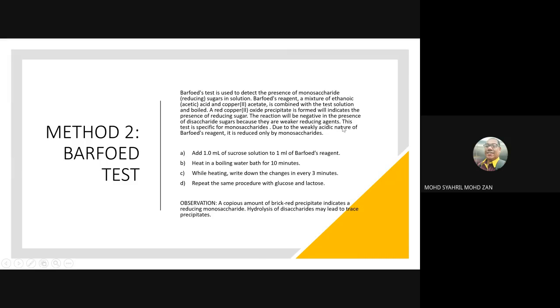Due to the weakly acidic nature of Barfoed reagent, it is reduced only by monosaccharides. Procedure: put 1 ml of sucrose solution and mix with 1 ml of Barfoed reagent; boil for 10 minutes, recording results at every 3-minute interval. Repeat with glucose and lactose. Expected result: a copious amount of brick-red precipitate indicates reducing monosaccharides. For disaccharides, hydrolysis is needed first and only a trace amount of brick-red precipitate will appear.